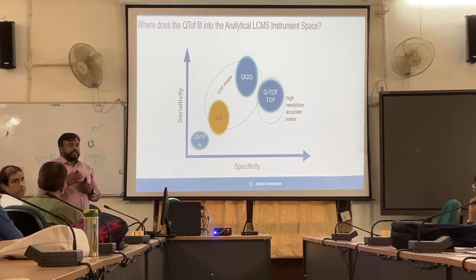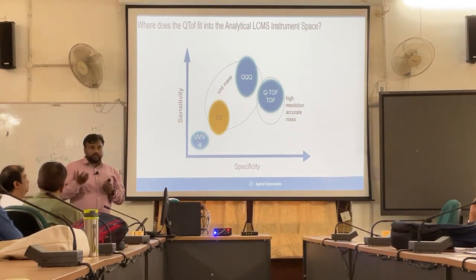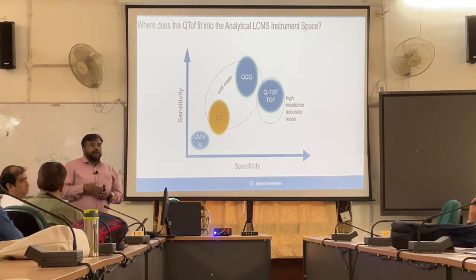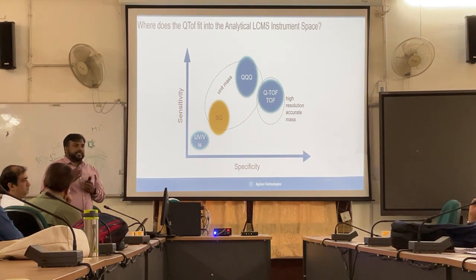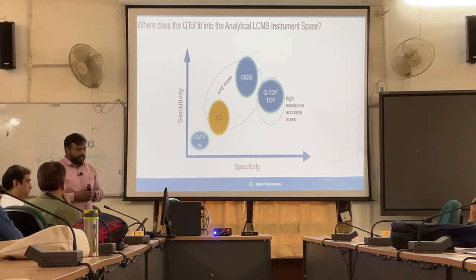In general, in chromatography, we have to resolve the molecules on the basis of chromatography by changing the polarity, and that is based on the mobile phase, or on the stationary phase by changing the column itself. But if we have many components, then mass spectrometry itself has the capacity to identify the molecule.